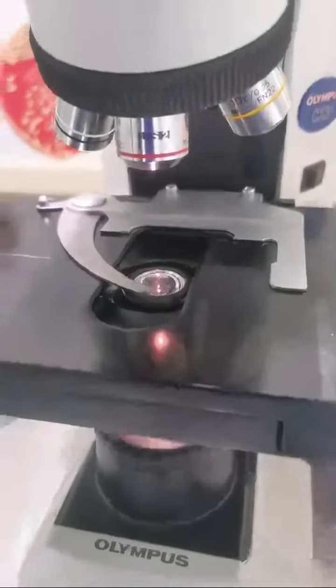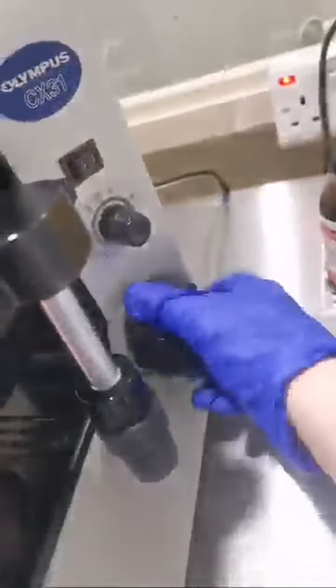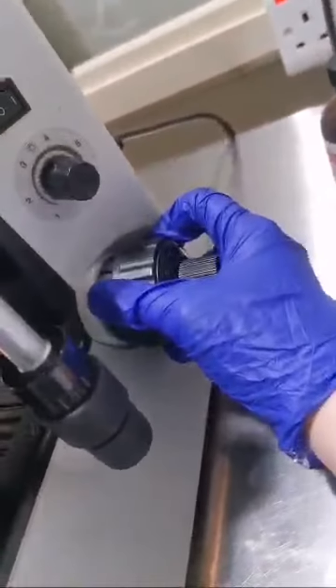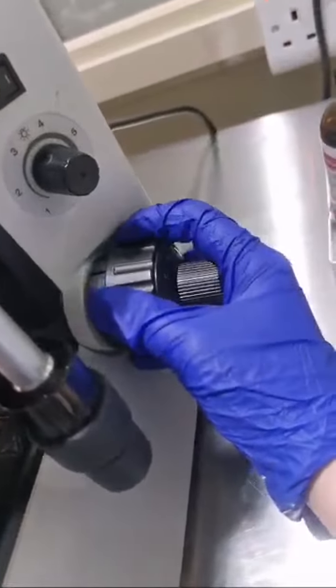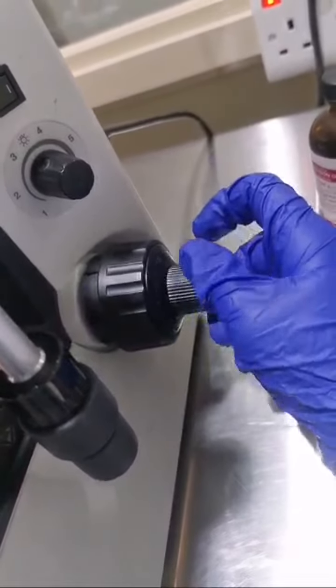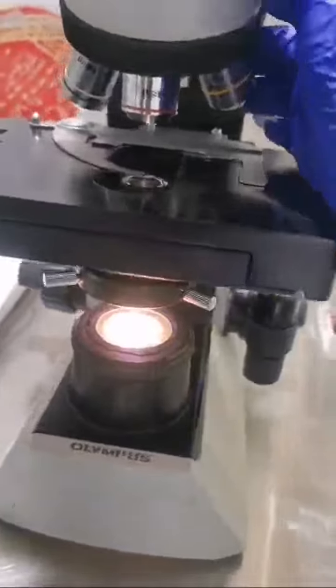If this one is open and if this one is open, then you have something like a slide. How will you do it? First, use the coarse adjustment knob. Then when you see something here using the coarse adjustment knob, you will stop and start to adjust this one. This is called the fine adjustment knob. Also, if you shift from one objective to another objective, be sure that you are also adjusting this one to give more light.